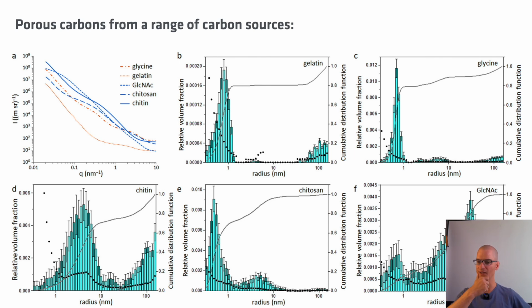On the other hand, you now have a different problem, right? You now need to convert the information in these size distributions to something that you can actually use and compare. So we basically shifted the problem from the analysis of the scattering pattern to the analysis of the size distribution.